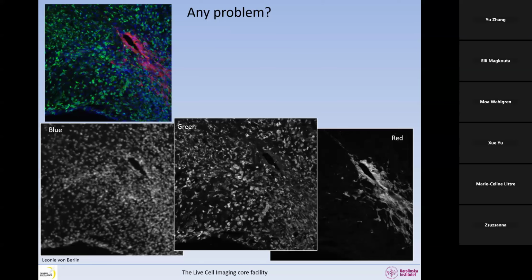There's a thick layer of mounting medium. Then we put the cover slip. We focus on the red, and the other channels are focused on a different Z level. So if you now focus on the blue, you will see that the red is out of focus. Okay, so this is chromatic aberrations. The blue channel is out of focus.